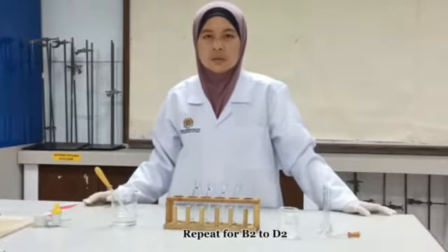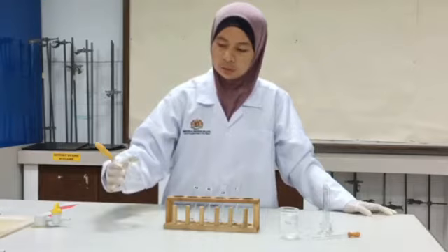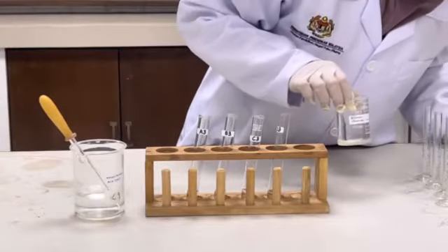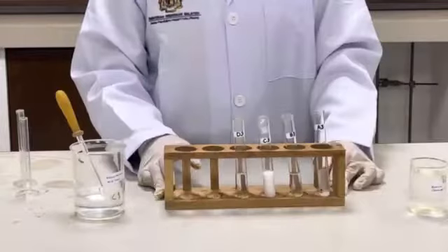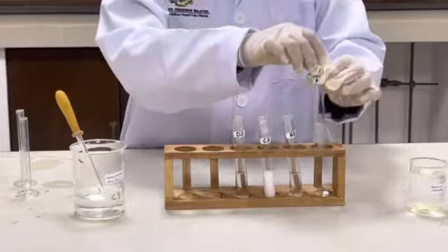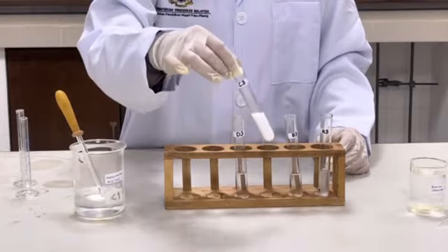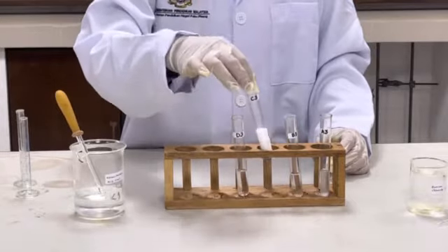Now we will do the test for sulfate ion. We need excess 2 mole dm³ hydrochloric acid and 2 cm³ of 1.0 mole dm³ barium chloride. The result of the sulfate test: for A3 no white precipitate, for B no white precipitate, for C a white precipitate occurs, and for D no white precipitate. Only salt C has a white precipitate.